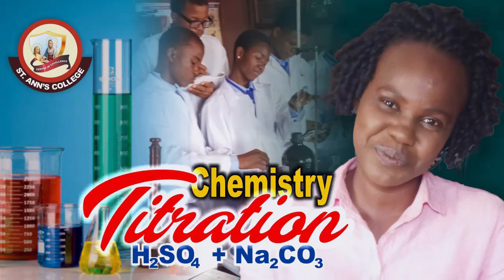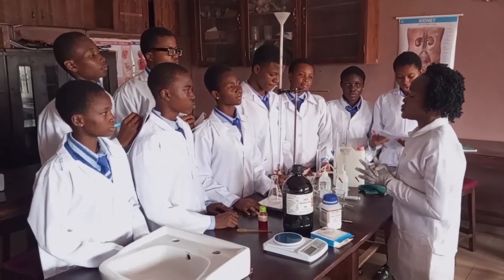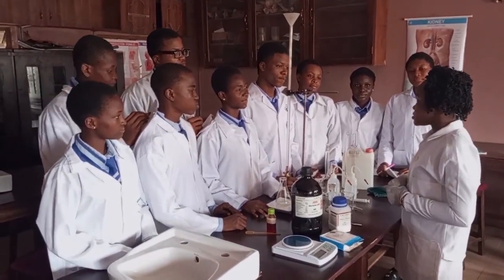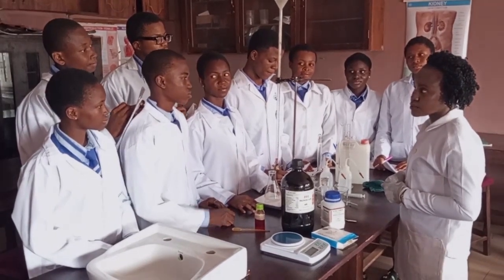Hello students. Hello teacher. We are here to carry out a titration practical. I hope you still remember what titration is all about. Yes, ma'am. Okay, what's titration?